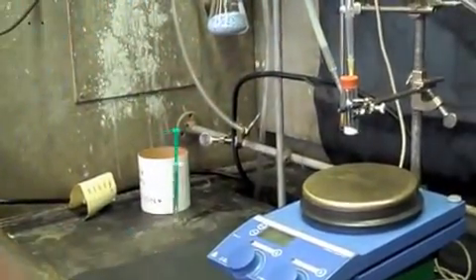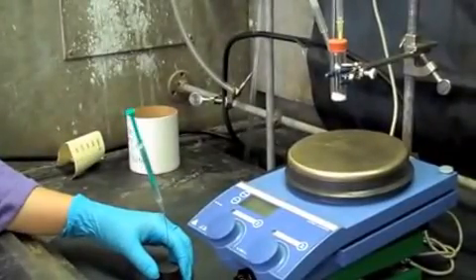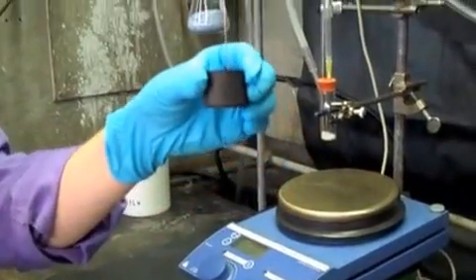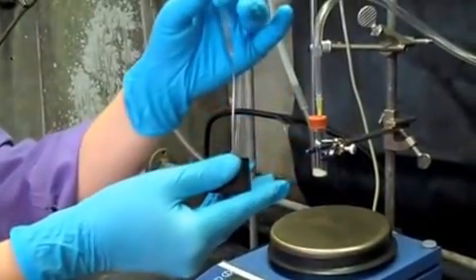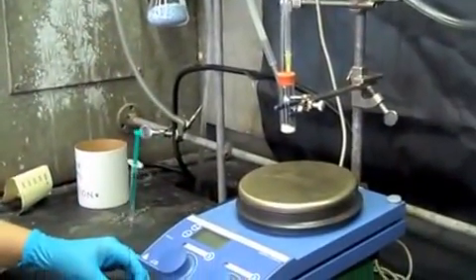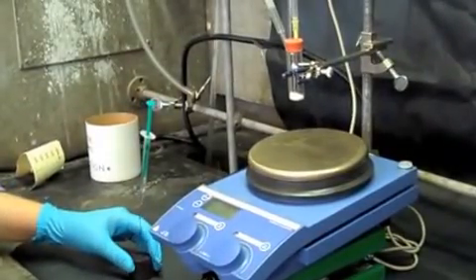Our flask has been purging for an adequate amount of time, so at this point, I'll remove the second needle and throw it into the sharps container that we keep below the hood. Remember to always throw your needles into the sharps container. In the meantime, I've acquired some dry THF in this needle. I had to walk around the lab with it, so I've put the needle into a stopper so that I can safely move about the lab.